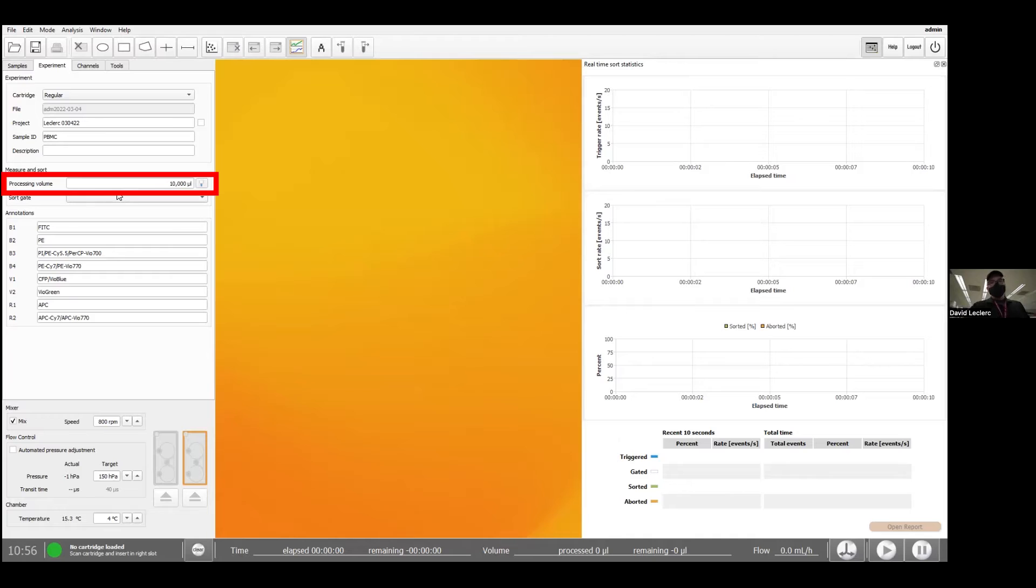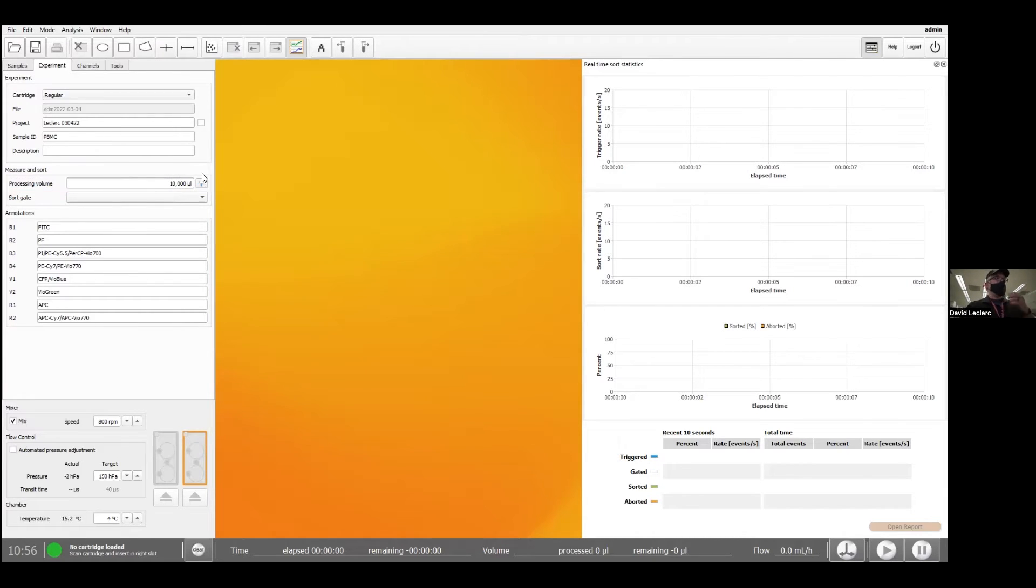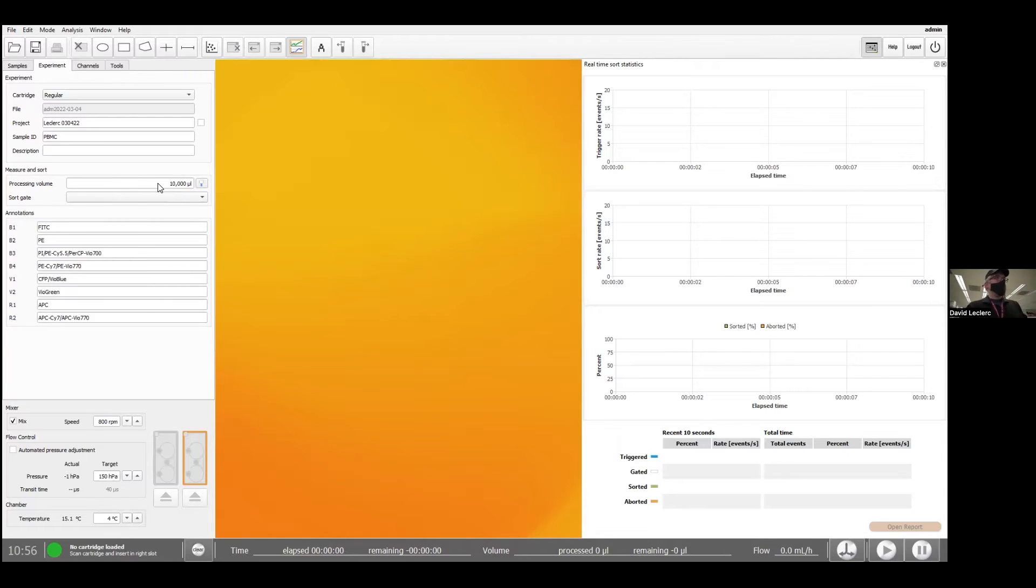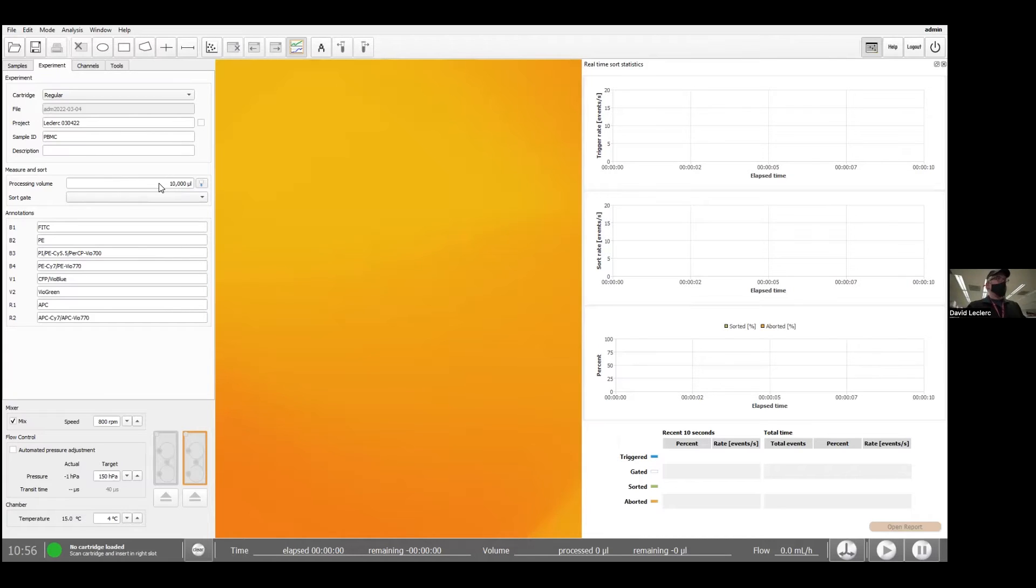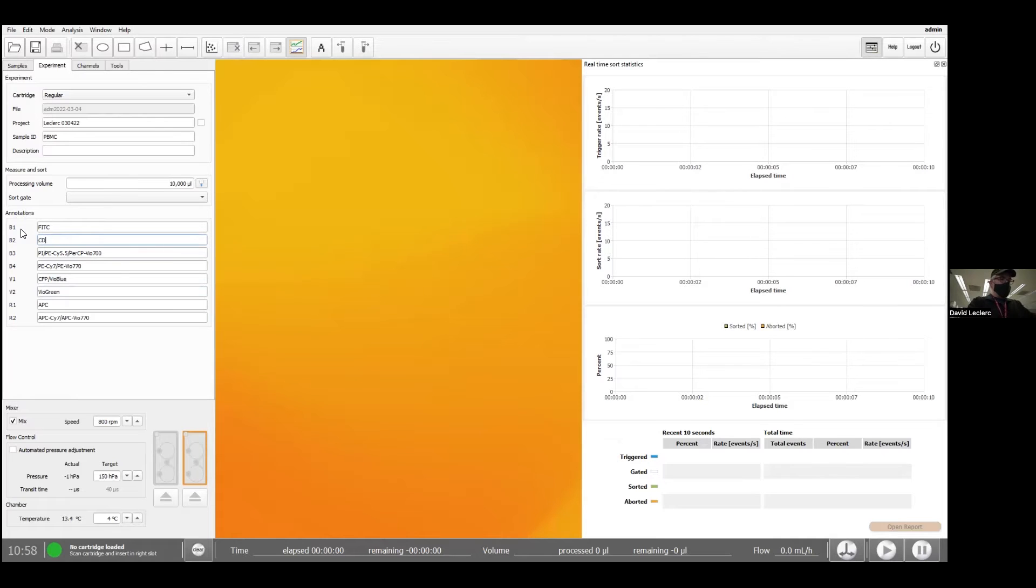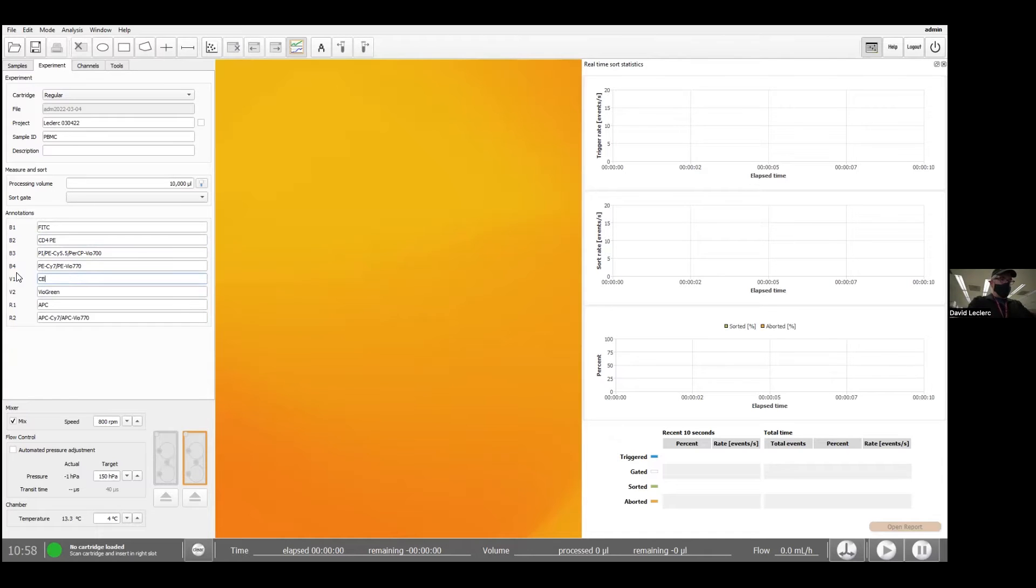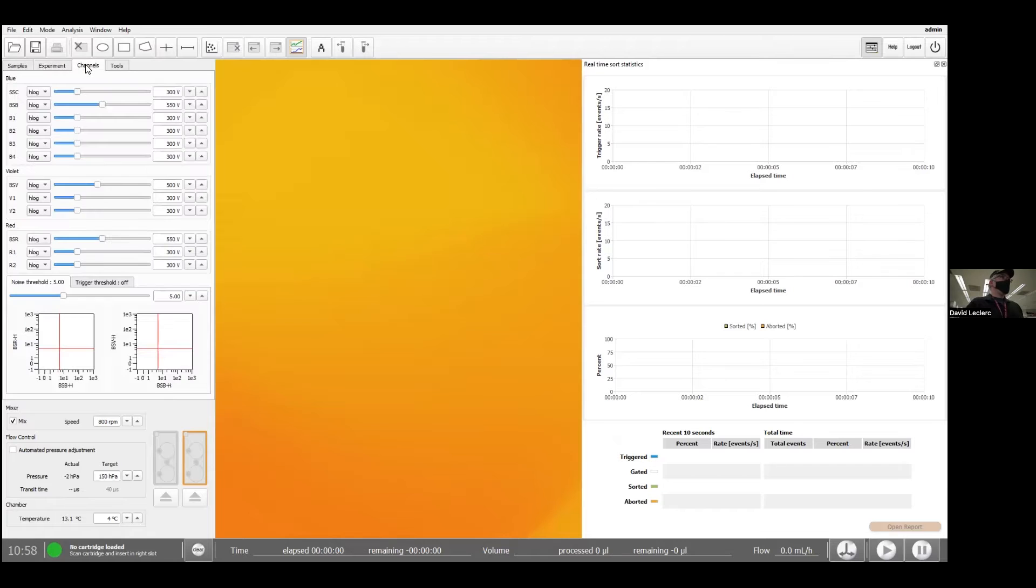Under processing volume, we're telling the software how much volume we loaded on the cartridge. I loaded two mls, but I'm going to keep this value to 10 mls, which is the maximum volume I can put in a cartridge. And whenever the instrument runs out of those two mls, it will stop the sort anyway. So we're good. We're going to use the annotation panel to relabel the axis. Now we're pretty much good to go.